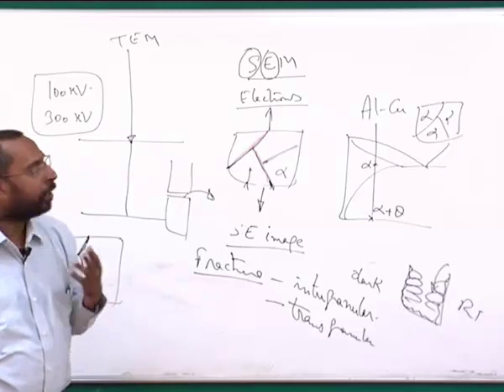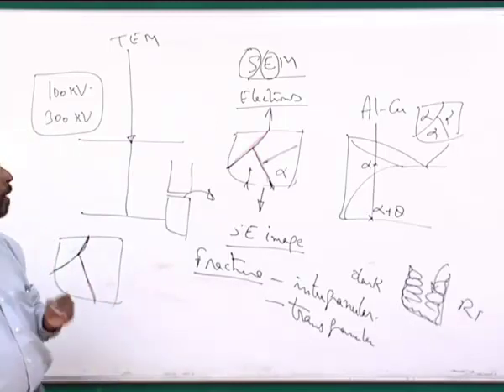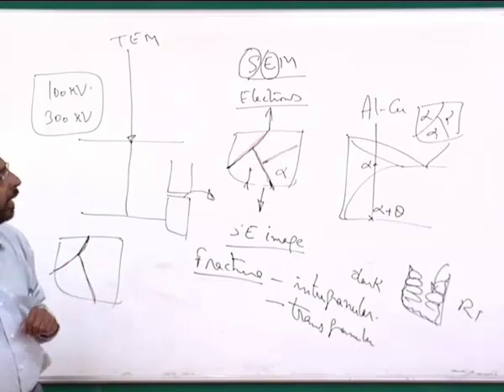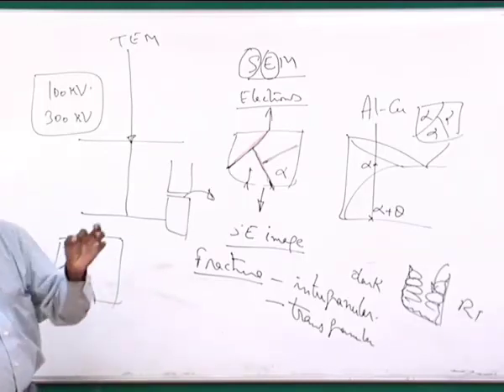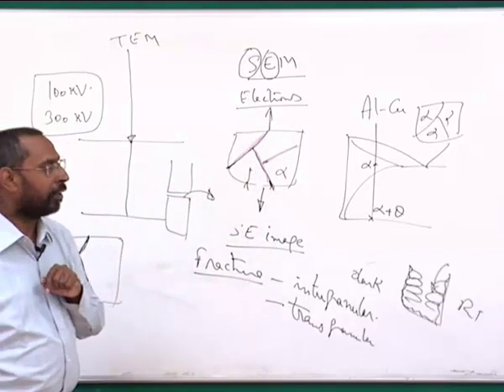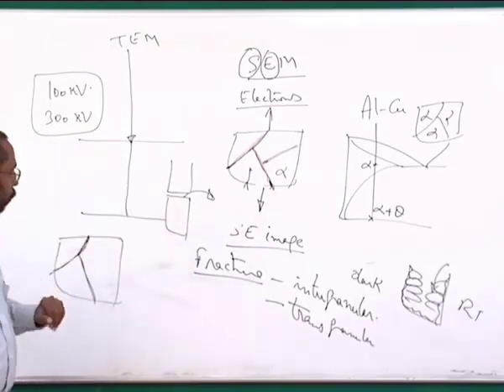As you all know, brittle materials are those where the resistance offered to crack propagation is very small, like the glass that we see in window glasses, where you can easily break such a glass, or a ceramic, let's say a coffee cup or something like that, where the moment a crack is initiated, it can propagate very fast. And similarly here, you will see that the crack propagation happens along the grain boundaries, and when I look at such a fractured surface, you will be able to see the grain boundary separation very clearly inside the material.